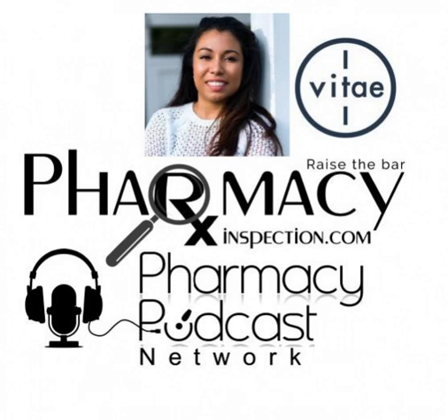So really the phase you're in now is still a beta phase, although I understand that you actually sent the equipment out to some compounding pharmacies and had a real test. Have they actually taken product out for third-party analytical testing? Are you doing that testing in-house, or are you sending that out to a third party? Tell me how that real QC analytical dosage testing works, so we make sure that we're getting consistent potency on the product.